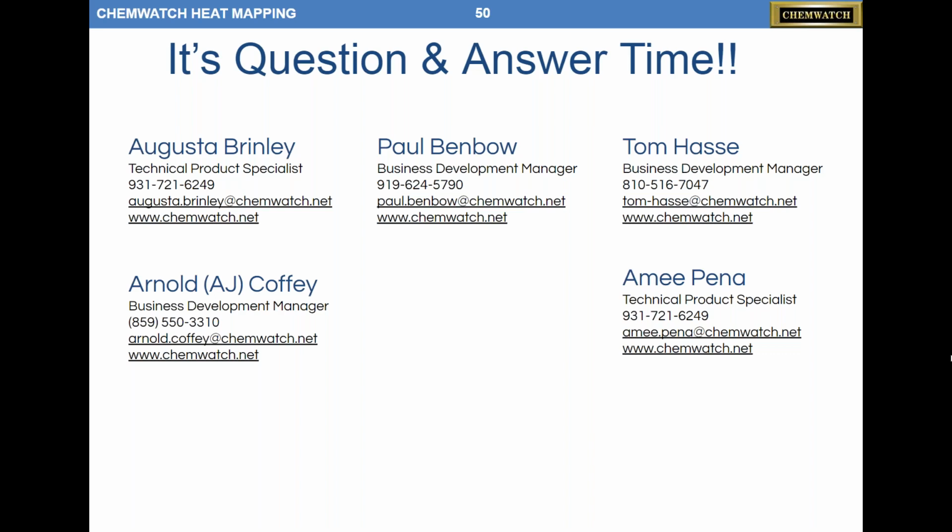If your inventory doesn't move much and you're just wanting to show management, or maybe have something for your firefighting requirements, it's an excellent tool. But if you need it to be real time, part of the Chemwatch roadmap is actually doing that in real time. So that's a great question.